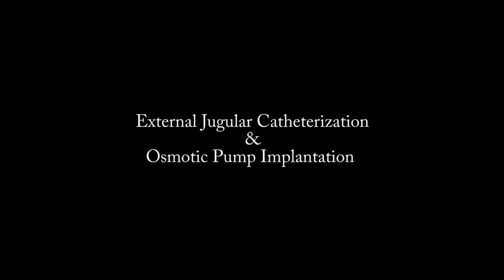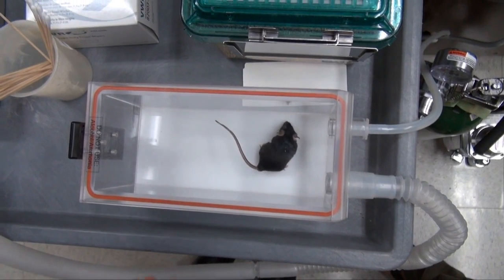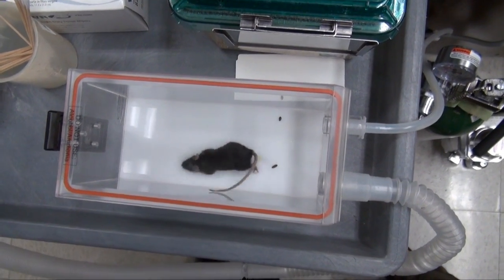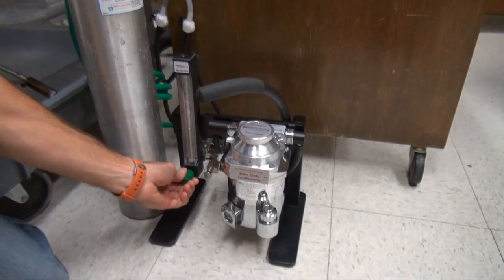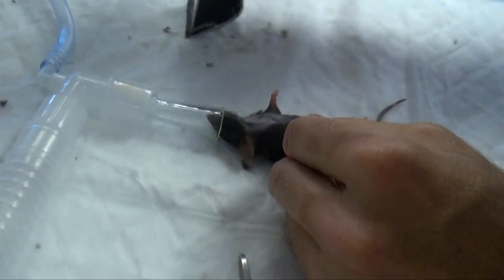Anesthetize animal in a sealed chamber with 3% isoflurane and oxygen for 3 minutes. Once adequately anesthetized, move animal to the workbench where continuous volatile anesthetic, 1.5% isoflurane and oxygen, will be administered by nose cone.